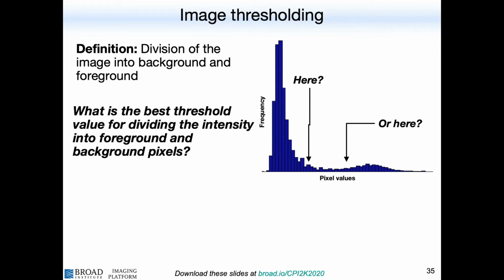So every image has pixels, and each pixel contains digital or numerical values. And most image histograms have something like this: a background peak with low intensity, and the stained objects showing with higher intensity as a second peak.